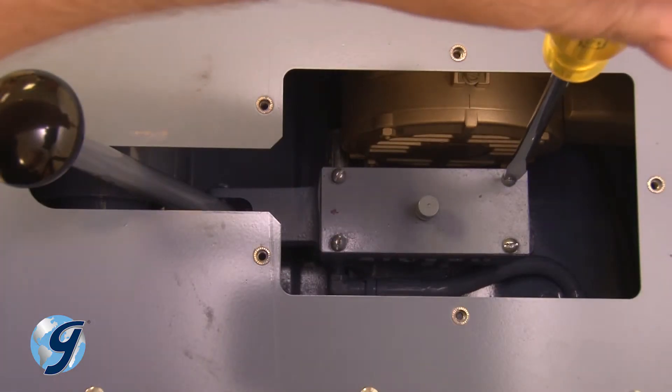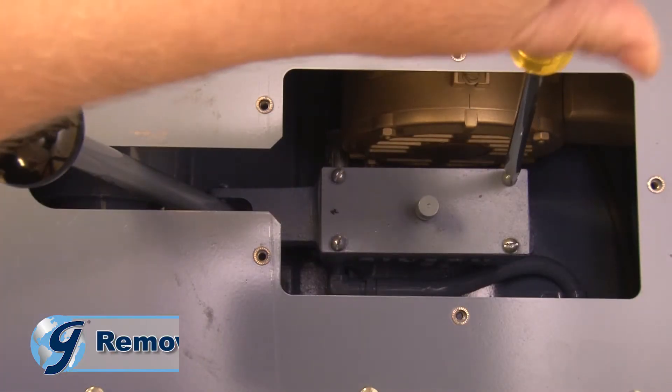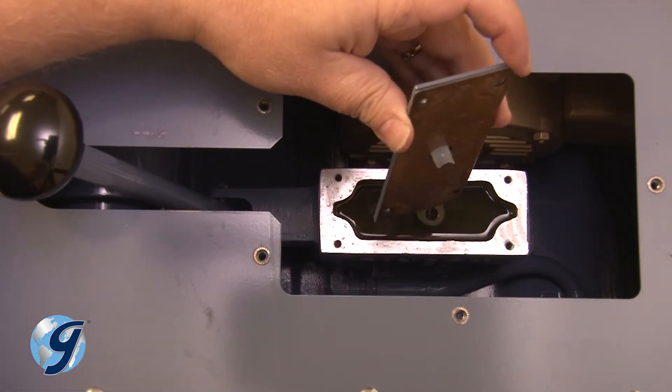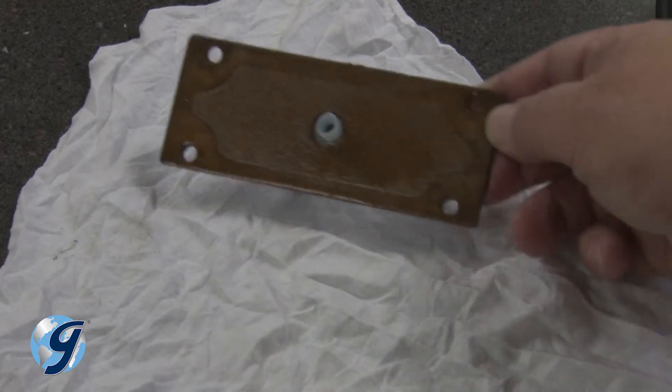Now, using a flathead screwdriver, remove the four screws of the pump cover and safely set them aside to a clean area.